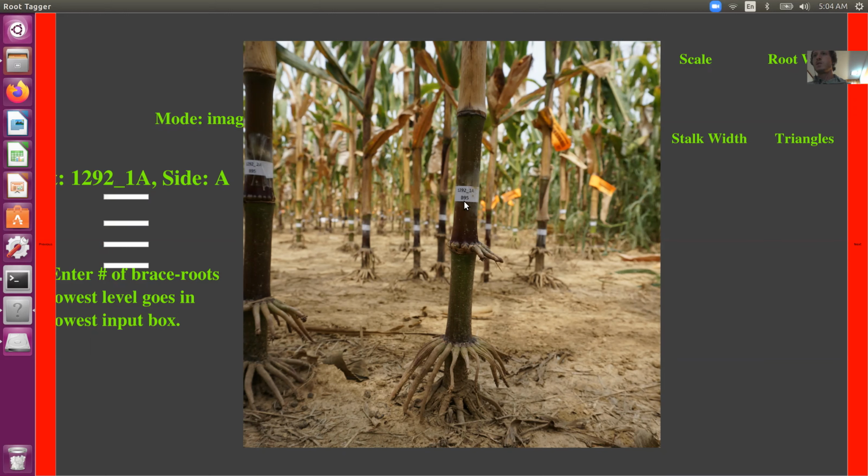So this is the first image in the folder. And we put labels here, which are 1/2 inch tall, so that we could get a pixels per inch or inches per pixel ratio. And when you tag this, you want to make sure that you're doing it perpendicular to the surface of the label, the edge of the label. So, for example, you'd want to do this. You can see the line that would connect these two dots is perpendicular to the tangent line at the top of this label. And that's because we're really trying to get the number of pixels that correspond to that 1/2 inch height.